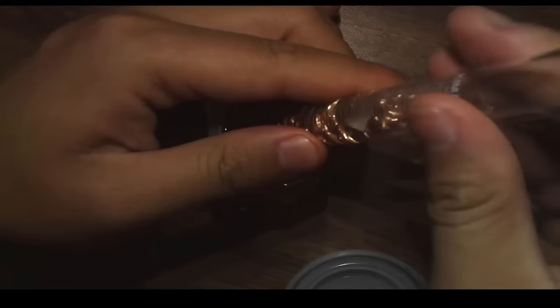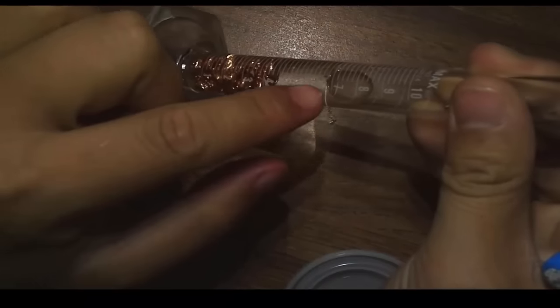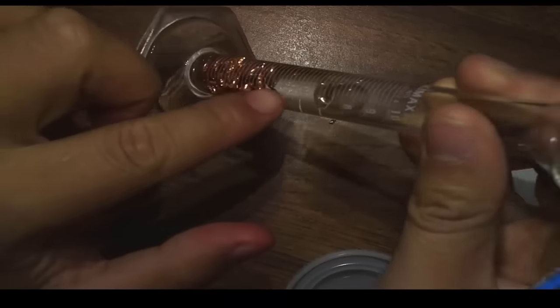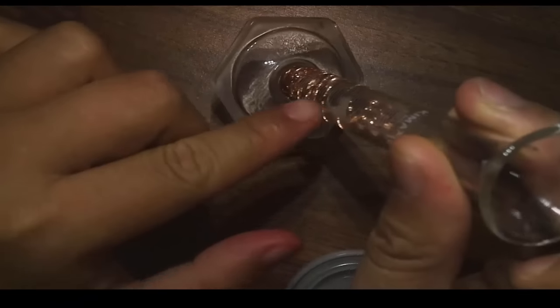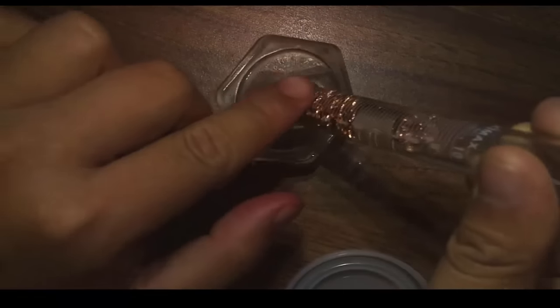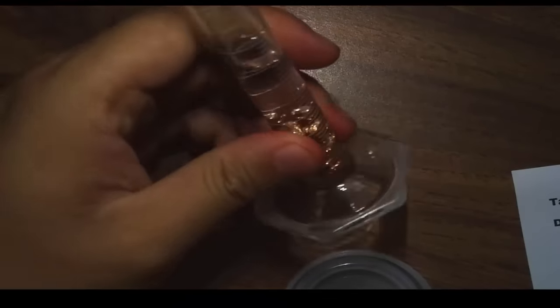And notice how the copper displaces all the volume down here. So now our reading is about 7 something, which is not how you're supposed to read the reading. But you can see that there is a change in the volume of the water. So you can see that there's a change in the reading level. And that is water displacement. And we can use this method to find the density of copper if we want to. So keep that in mind.